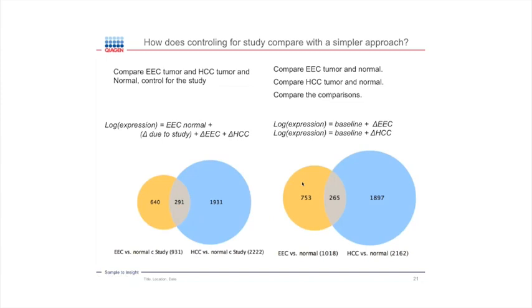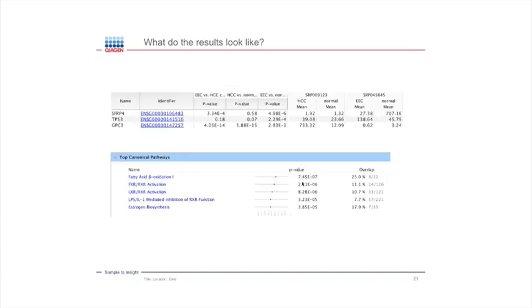So I'm running out of time. The very last slide I've got is to try and say, okay, so I've tried to do this comparison and only look for genes that are different between the two cancers, that aren't shared between the two cancers. How well have I done at that? And I've got 3 genes here just to show what's going on.